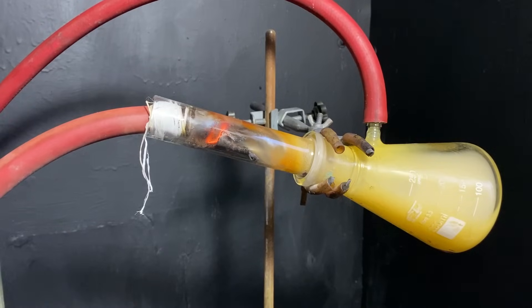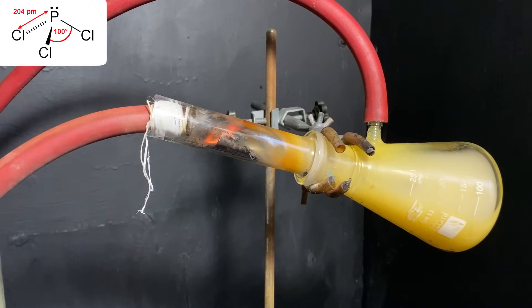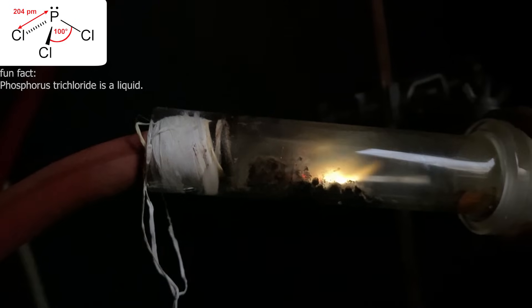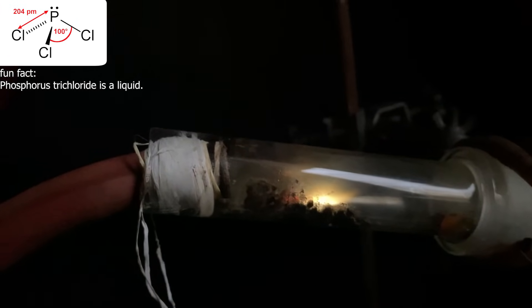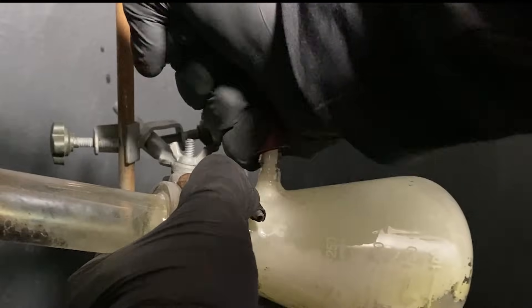Eventually, the white mist turns this yellowish color, and that's due to some phosphorus trichloride forming. And to convert the useless trichloride into the useful pentachloride, I generate some excess chlorine, which will react with the trichloride.